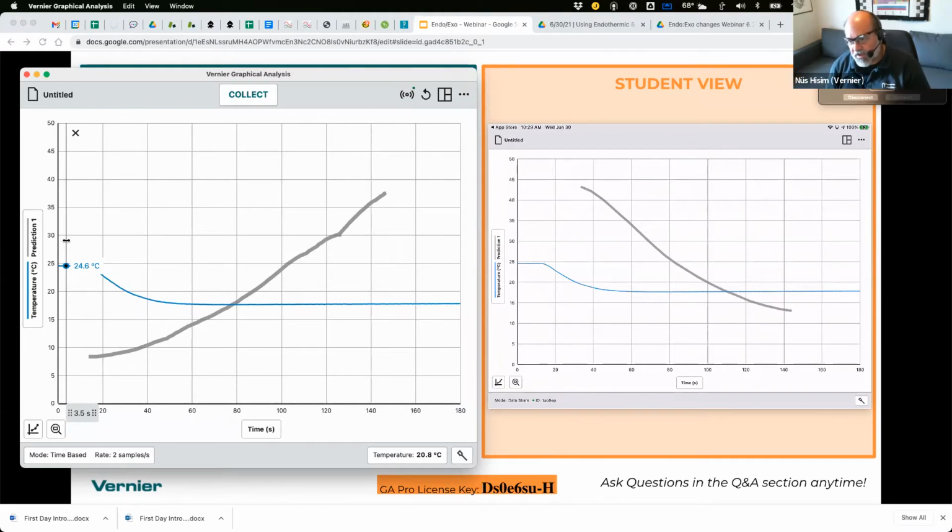it's your call. Okay. Let me rinse the cup because we're about to do this again, but they have to write down the minimum, maximum, and then they're going to do everything exactly the same, except we're only going to change one variable. Okay, so we're going to do it all exactly the same.